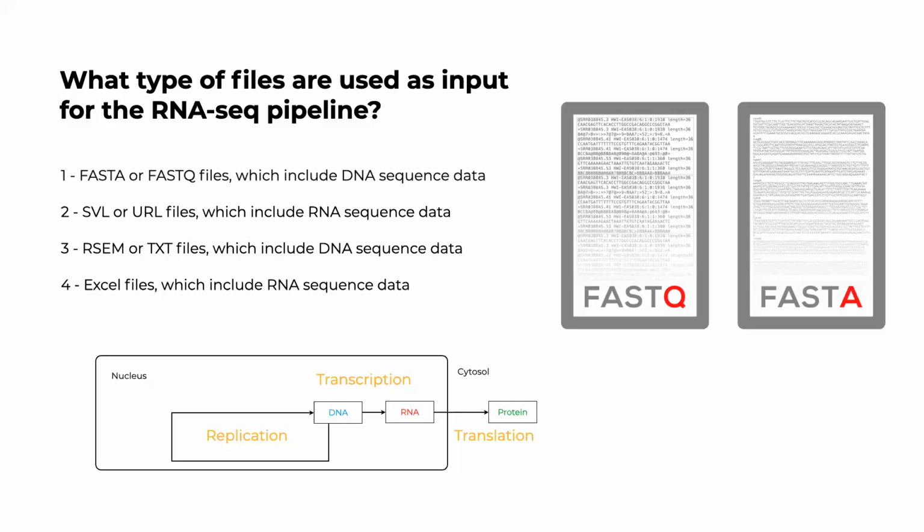Now, what is the raw data? The raw data are individual reads. And you do, in any of these pipelines, first quality control of the reads. In fact, Bowtie internally has a quality control script involved in first looking at the quality of those reads, and all of the reads that have low quality are discarded before you actually do the mapping. Now you get statistics on how many reads were mapped and the quality of mapping in one of the outputs. We will look at that tomorrow when these pipelines have finished.